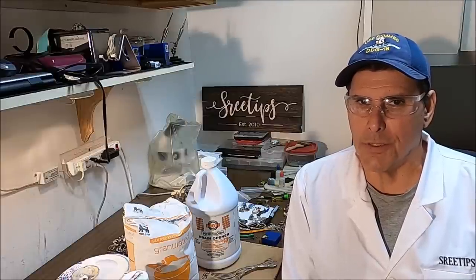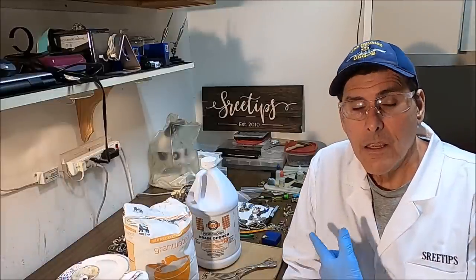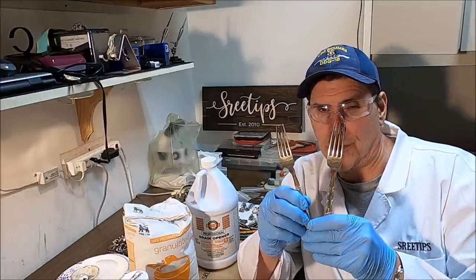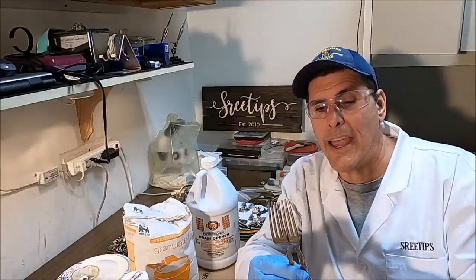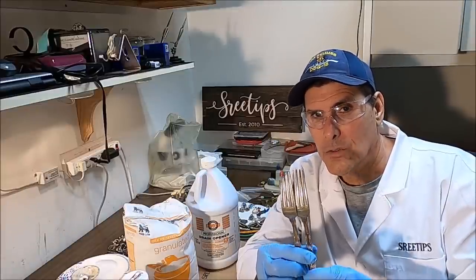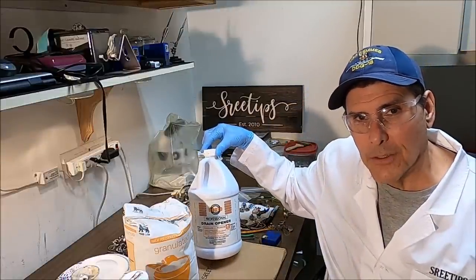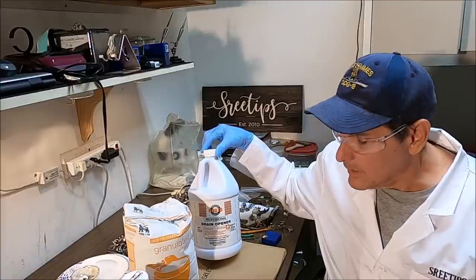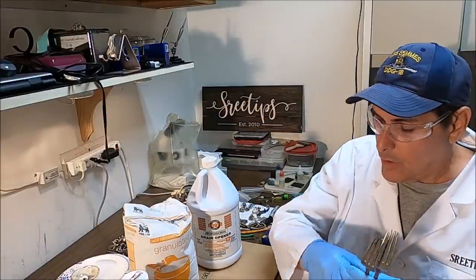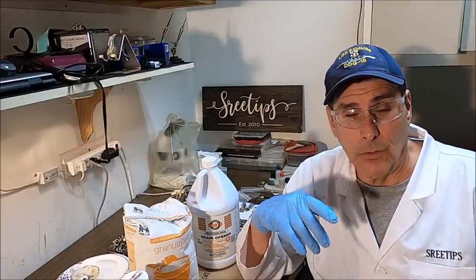Welcome back to the channel. Today I'm going to use the lye-sugar method to refine some pure silver from these forks. These forks are made of sterling silver — sterling silver is an alloy of about 90% silver and 10% copper. We're going to dissolve the forks in some Rooto Professional drain cleaner, which is 93% concentrated sulfuric acid, dissolve the forks, and rinse all the copper out.